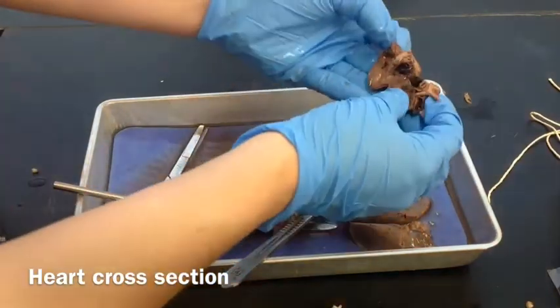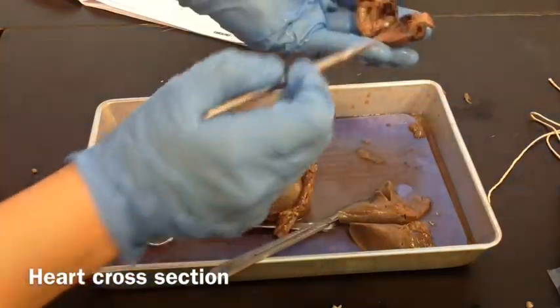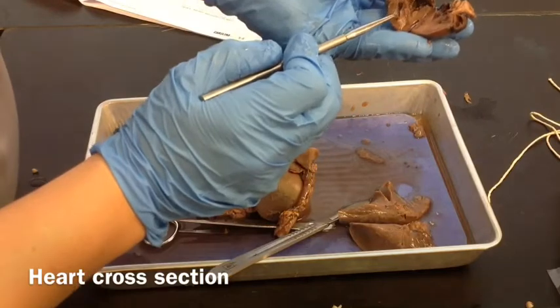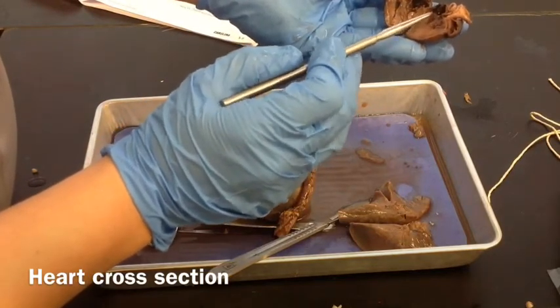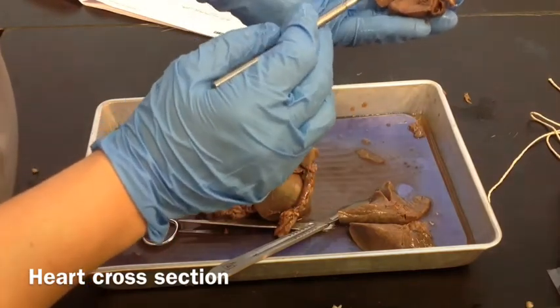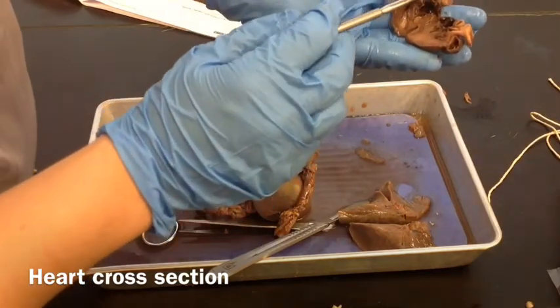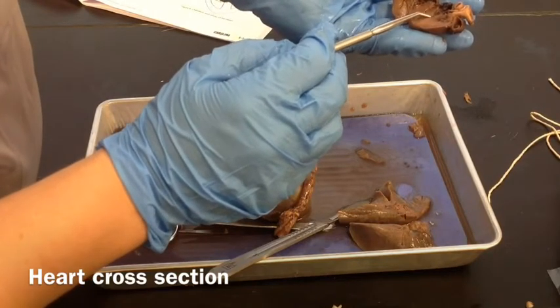Now we see the inside. This was the front, so on the inside we're looking at the four chambers. We see the right atrium, the left atrium — and there's some blood, it's clotted up in there. The right ventricle and the left ventricle are on this side. This one goes up into the aorta, and this one goes out into the pulmonary artery to the lungs. After the blood leaves the right atrium and the right ventricle, it goes to the lungs to get oxygen. It comes back into the left side, and then goes out through the left ventricle out the aorta to the body.